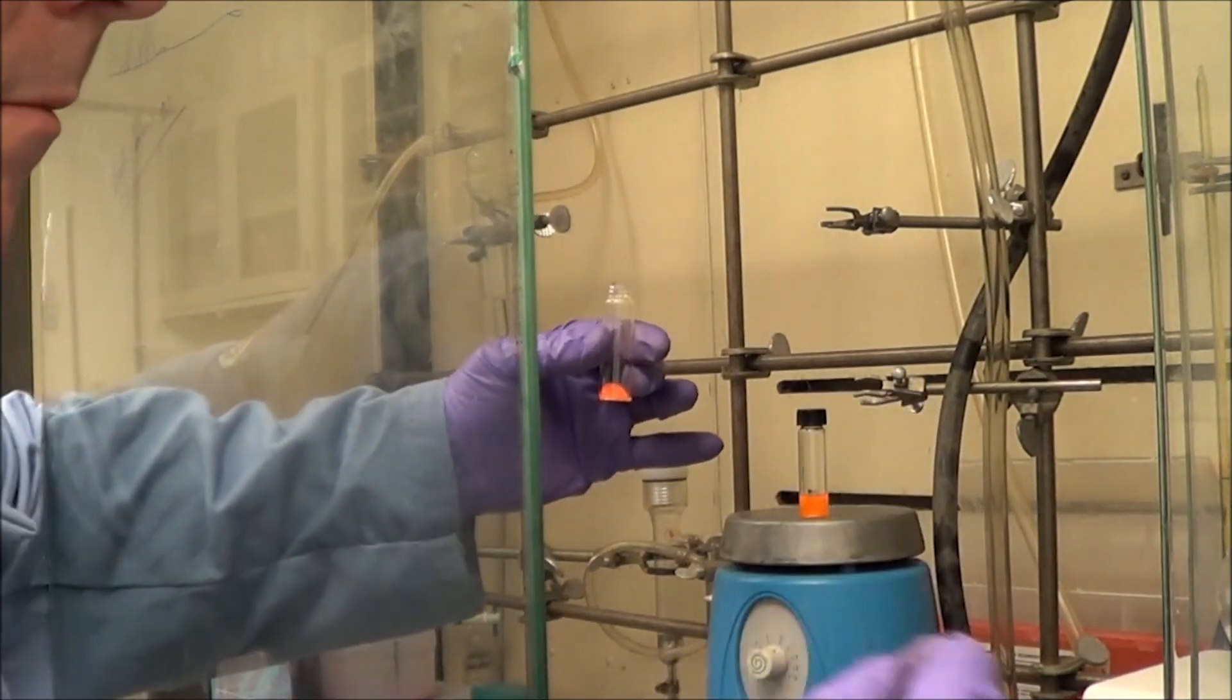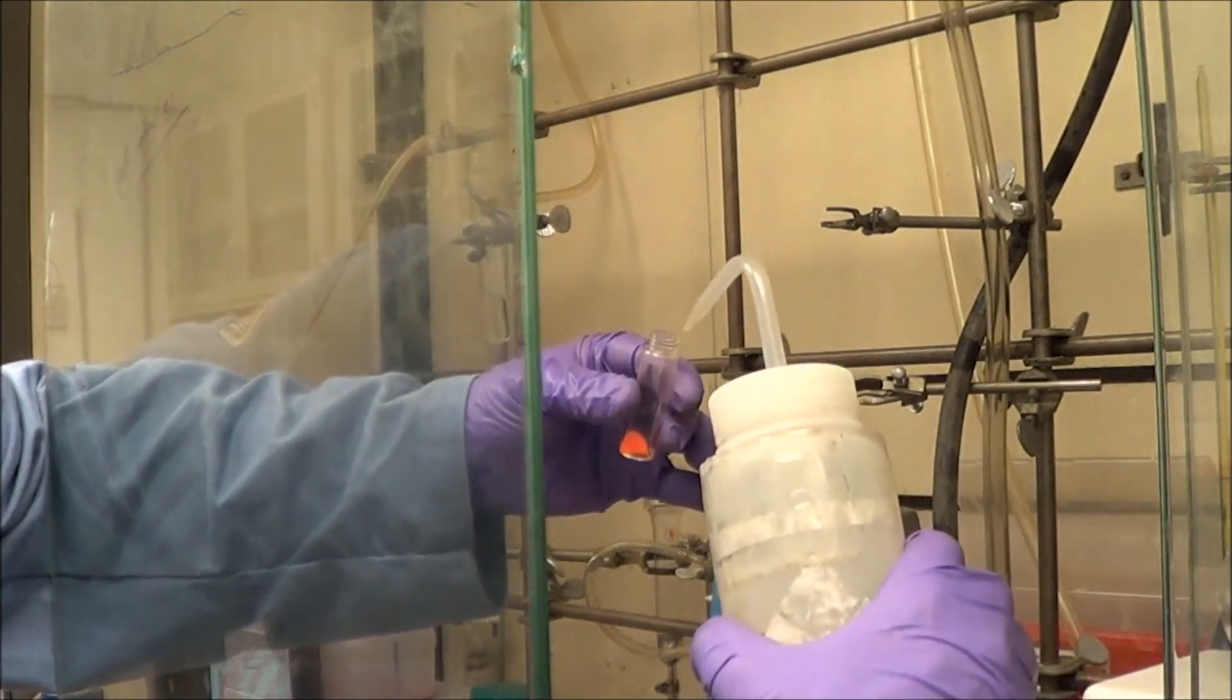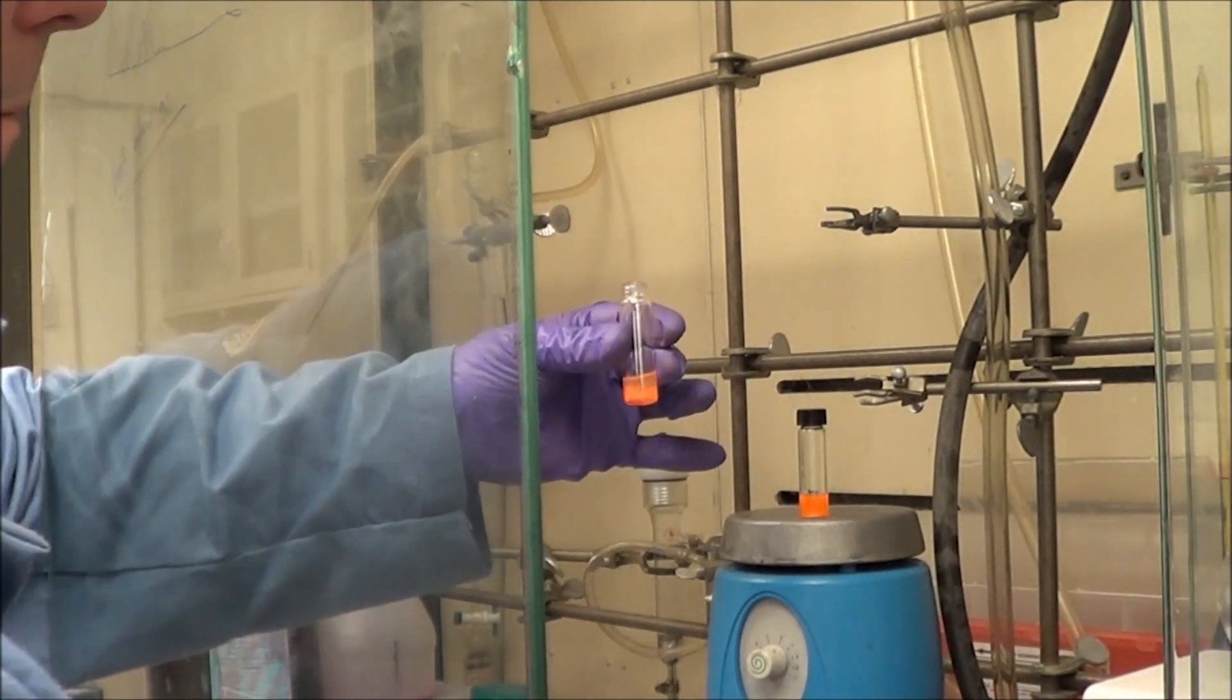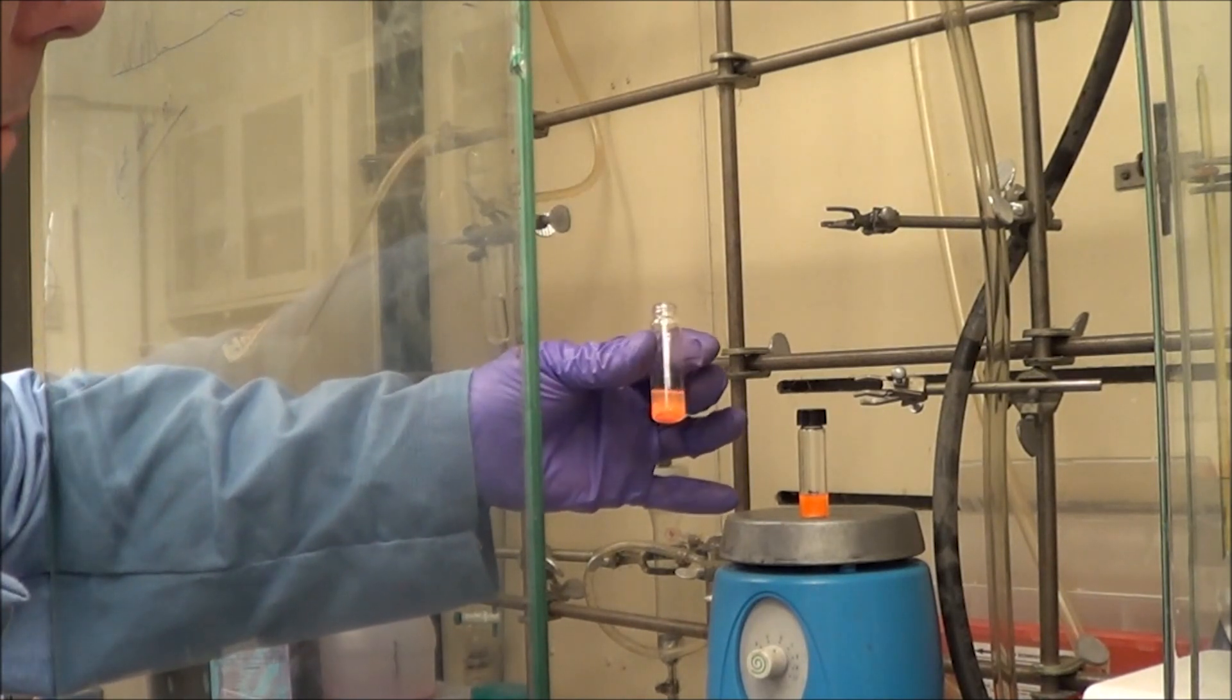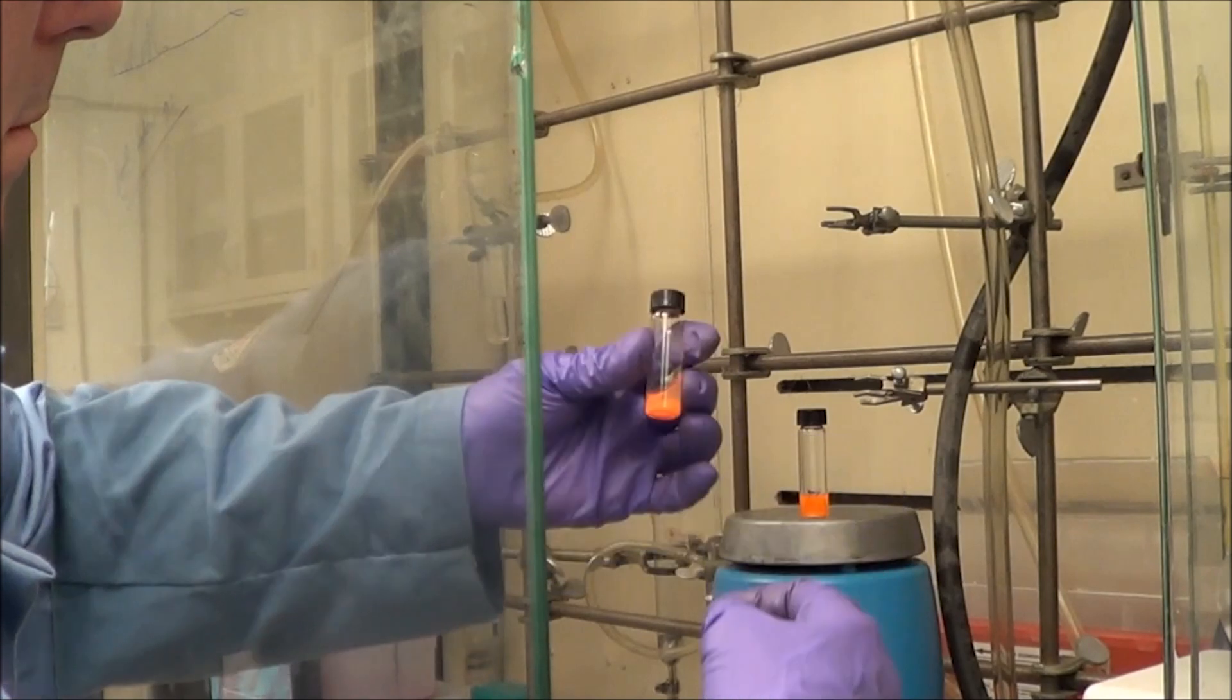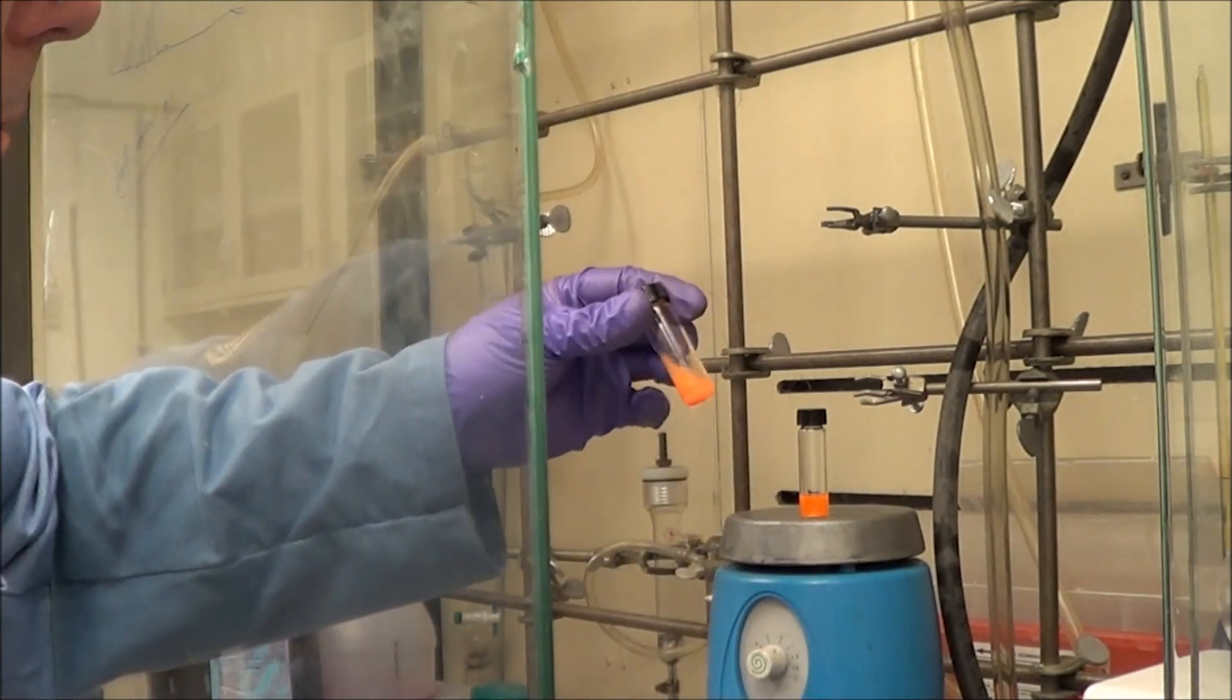The next thing we have to ask ourselves is how greedy are we? Because you see there's still a little bit of QDs left in that paste, and if I want to get them out, you can see I'm adding about another two mils of hexane. I'm going to repeat the process, shake the sample, break up the paste, centrifuge, and collect the hexane with dots in it.